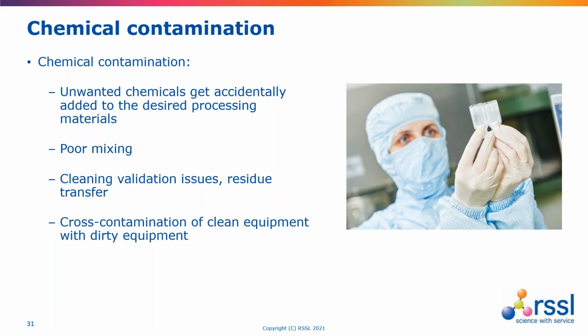And it's also important that cleaning validation is using an appropriate representative of the product or a good surrogate like riboflavin or something like that. And then it's also equally important that equipment is kept clean and dry and there's no cross-contamination. And I'm just throwing that in there to emphasize that often a contamination control strategy, because it's in Annex 1, is thought of as a microbial control strategy. It's more than that. It needs to embrace any form of contamination that could ultimately cause product adulteration.